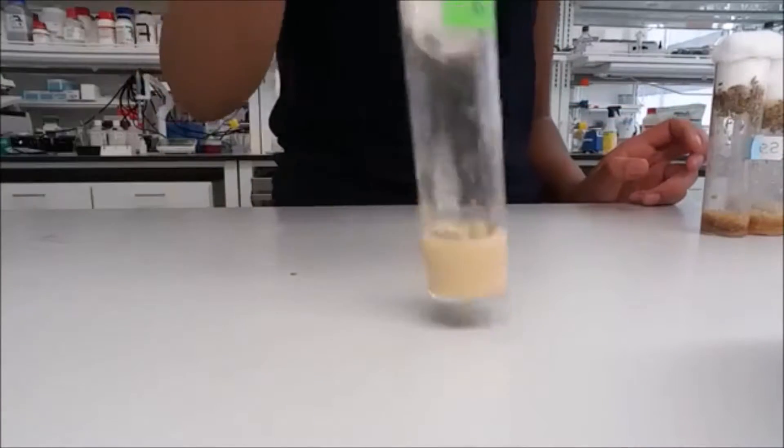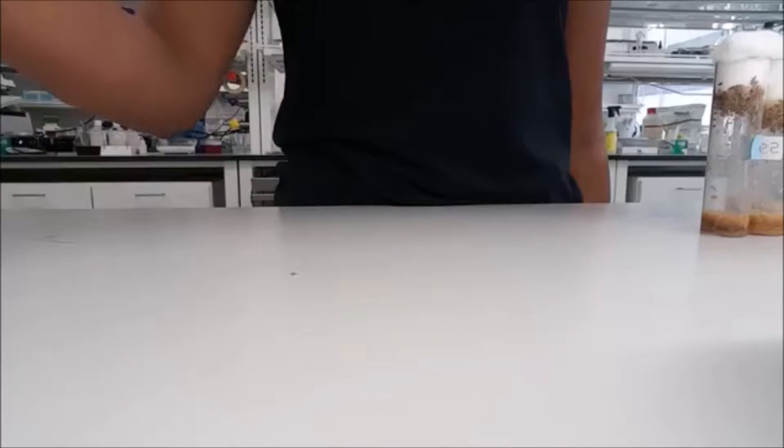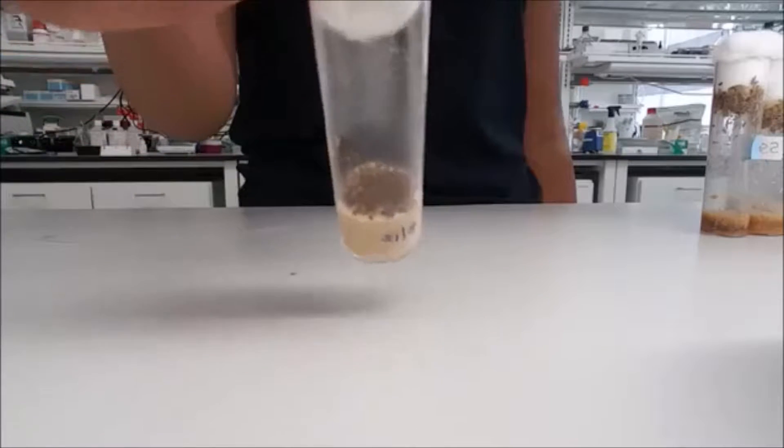For example, this is a very good vial in that there are a perfect number of flies, whereas this vial is overcrowded. You can see that a lot of them have been stepped on and killed because there are too many in the vial.